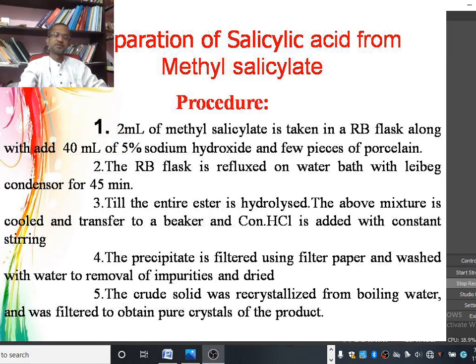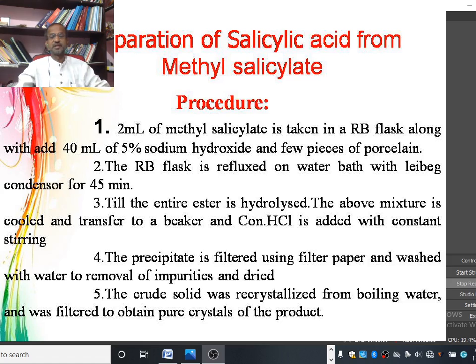The procedure adopted for the synthesis of salicylic acid: 2 ml of methyl salicylate is taken in the round bottom flask along with 40 ml of 5% sodium hydroxide solution, and a few pieces of porcelain bits are added. Then the RB flask is refluxed on the water bath with the Liebig condenser for 45 minutes.